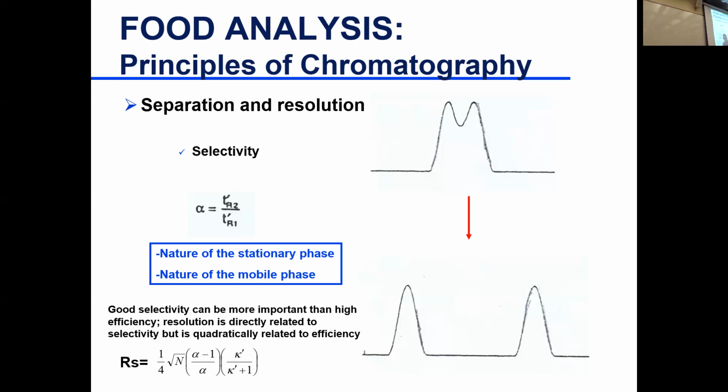You're not getting separation. So you say, okay, if I remove acetonitrile and put methanol instead, methanol is still organic. It's less polar than water, but it's more polar than acetonitrile. So what you did here is enhance the selectivity between these two compounds.